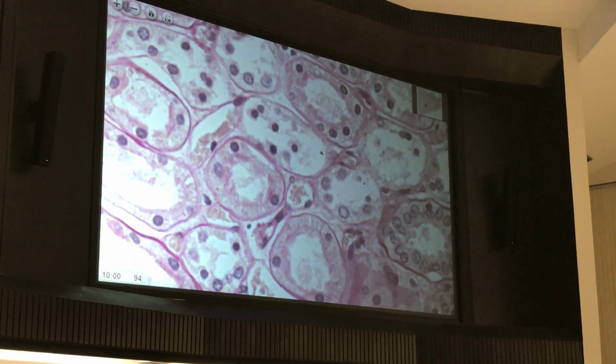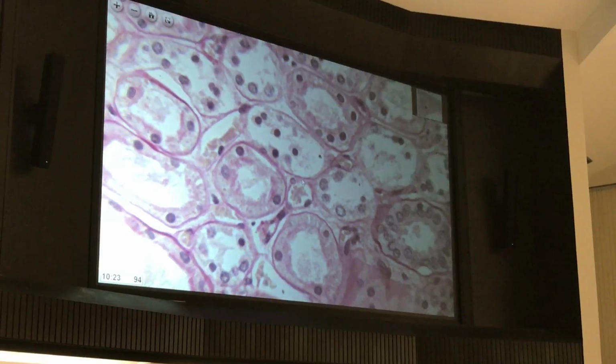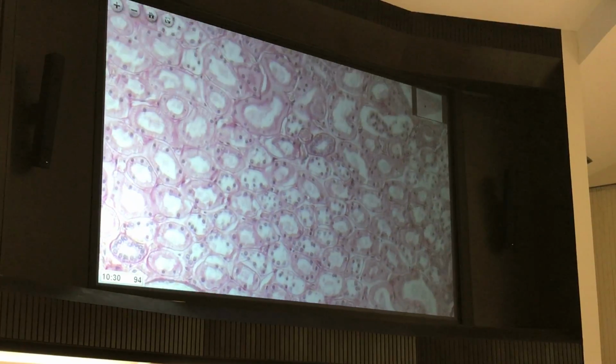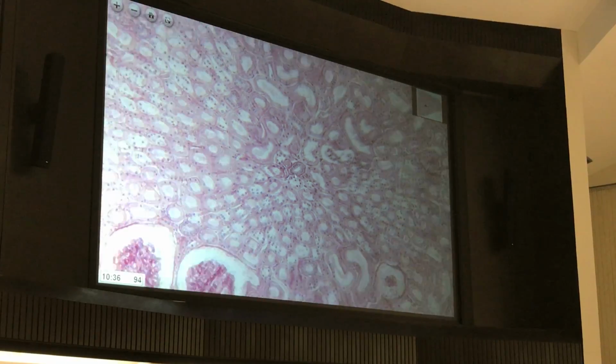Would you want to call that? If I said, what's the name specific to its location? What's the name of this epithelium? What do we call the simple squamous that lines a blood vessel? Endothelium, right? So generically it's a simple squamous. Otherwise, if I ask you specifically, you can really see these nice little, there's a really nice simple cuboidal here.